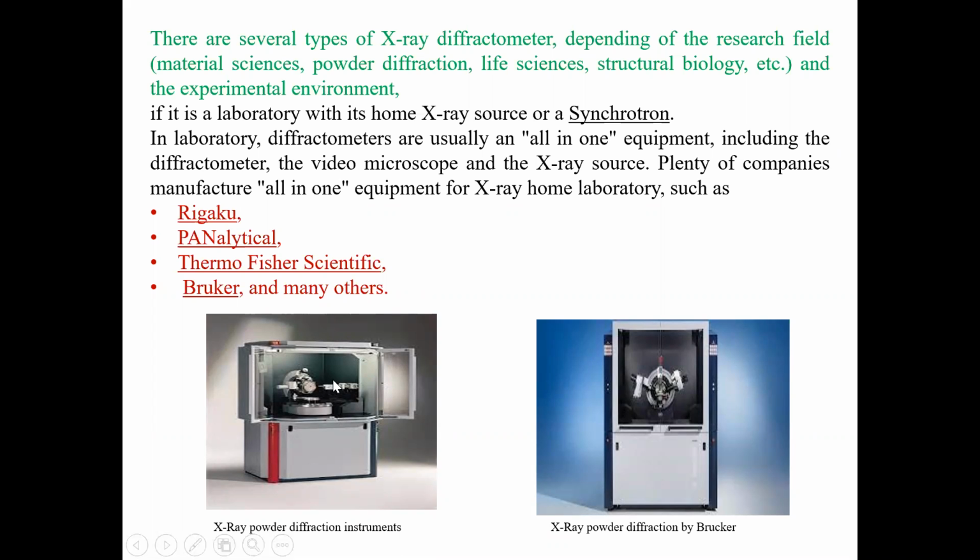सो एक्सरे डिफ्रॅक्टोमीटर हा वेगवेगळ्या पद्धतीचे असते आणि वेगवेगळ्या ठिकाणी ते. सो बायोलॉजिकल सॅम्पल असेल तिथे वेगळं एक्सरे डिफ्रॅक्टोमीटर असेल, बट जर केमिकल सॅम्पल असेल तर तिथे वेगळ्या पद्धतीचा एक्सरे डिफ्रॅक्टोमीटर्स आपण घेत असतो स्टडी करण्यासाठी. सो इट डिपेंड्स अपॉन द एन्व्हायरमेंटल कंडिशन्स ऑल्सो.